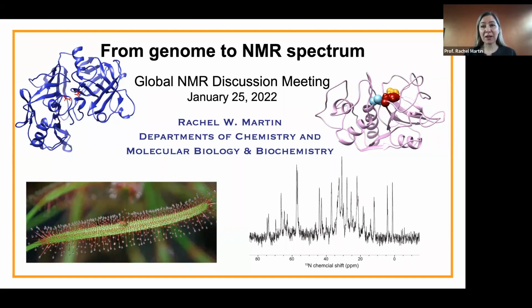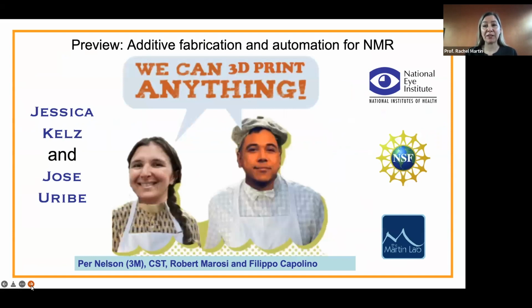So today I'm going to talk about a different aspect of NMR spectroscopy. A lot of you have probably seen me talking about building probes, and today we're going to talk about the other end of the process, which is sample preparation. I'm going to go through how we pick an interesting protein target for structural biology.